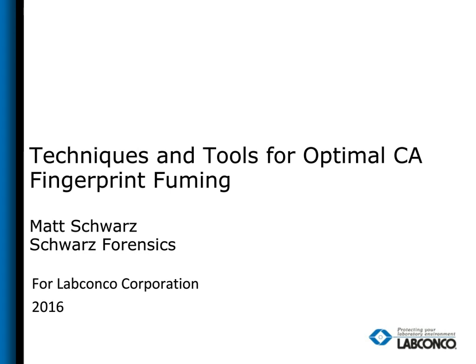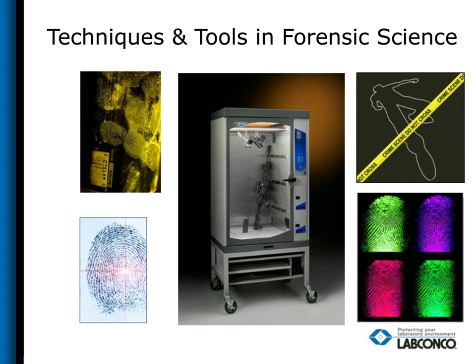We're going to be talking about latent print development using cyanoacrylate, also known as CA or superglue fuming. It's an easy-to-use and cost-effective method that's used widely throughout law enforcement and forensic laboratories across the world. This technique can be used in the field or in the lab interchangeably. The issue with it, since it is so easy to use and cost-effective, is consistency. Laboratories tend to fail to realize the mistakes or errors built into the process used.